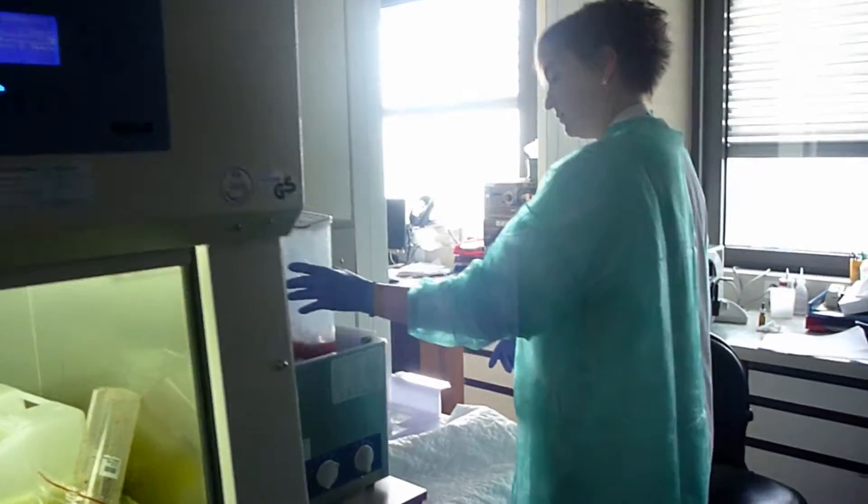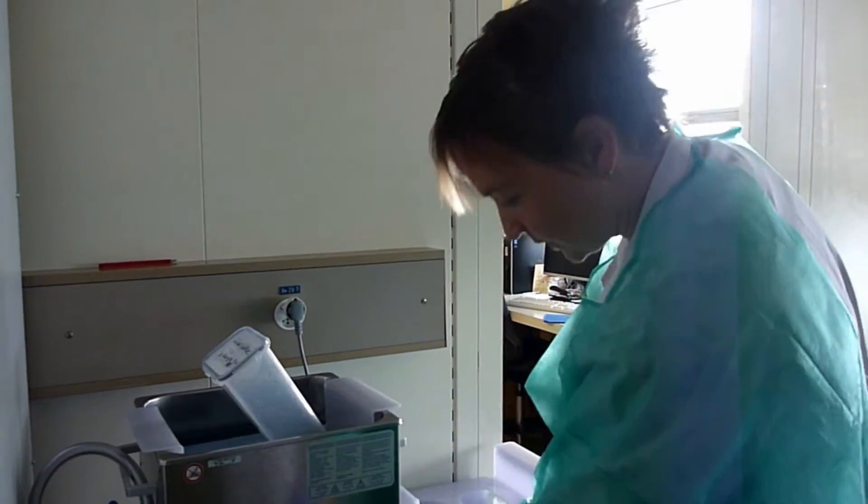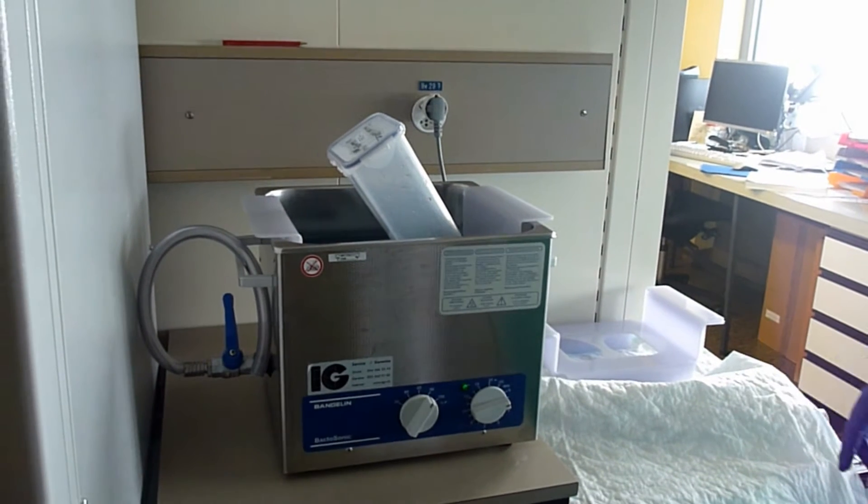Put the box in the sonication bath. It's about one minute of sonication.